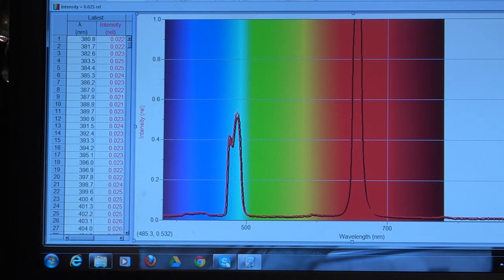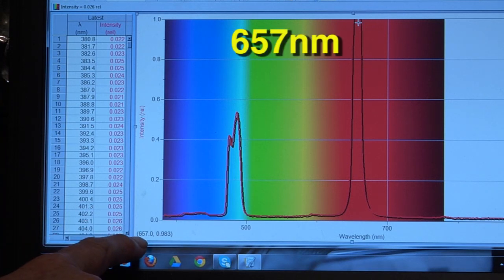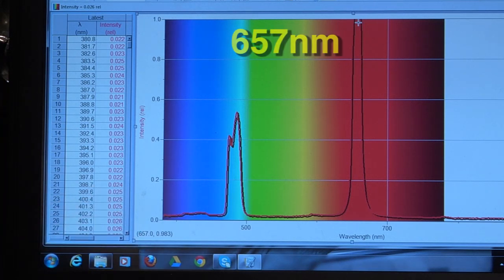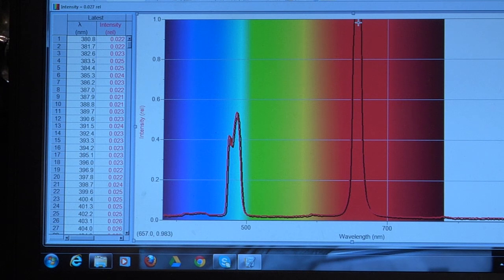If we move over here to this peak, it's 657 nanometers. So those three in the visible are characteristic of hydrogen. No other element is going to give you that same three wavelengths.